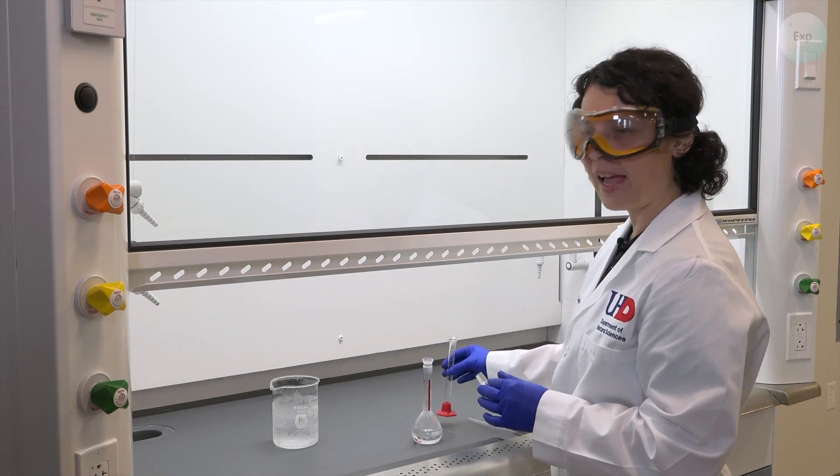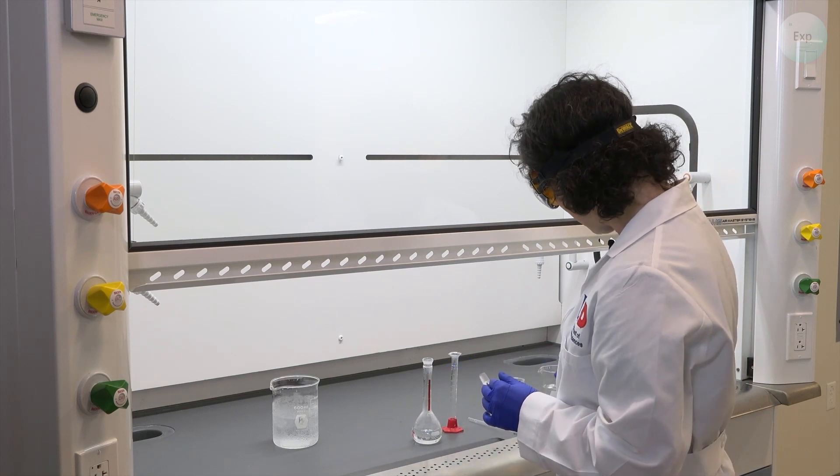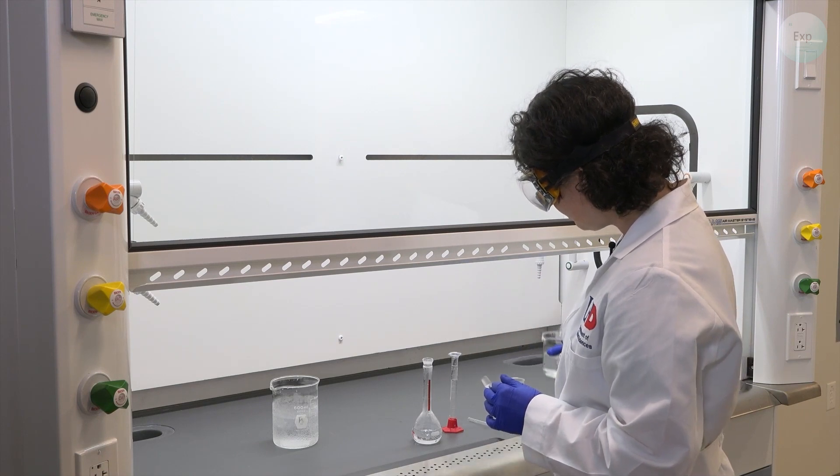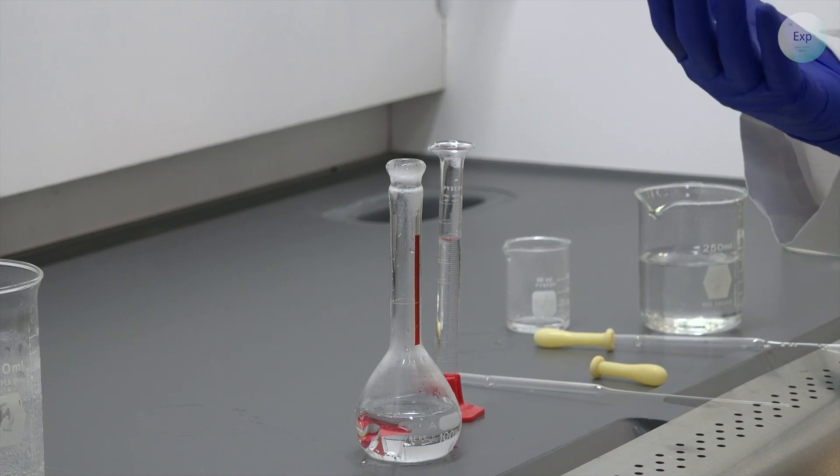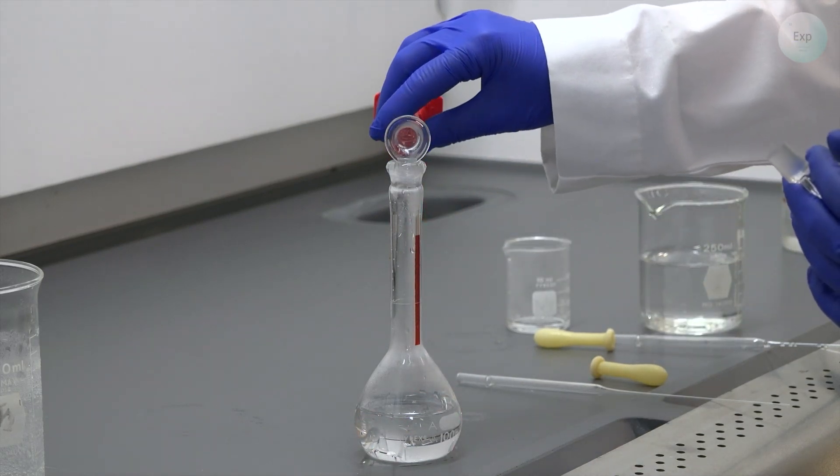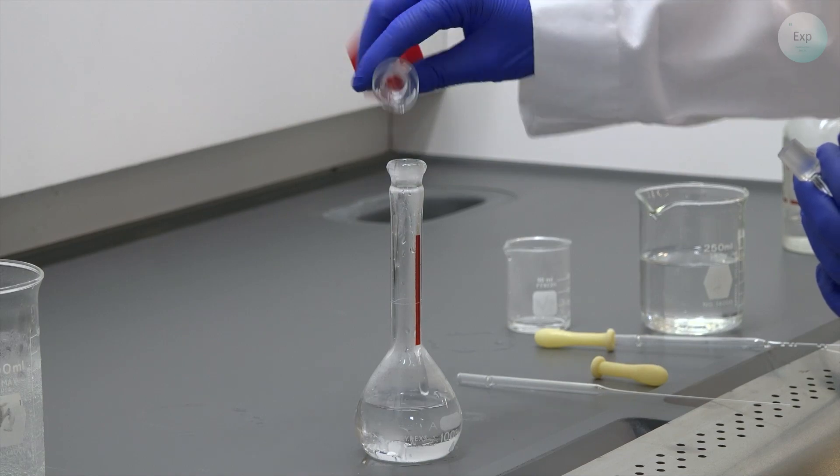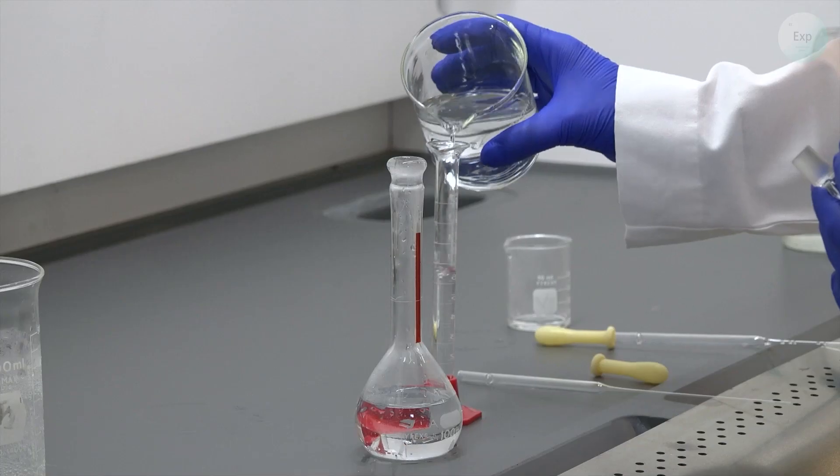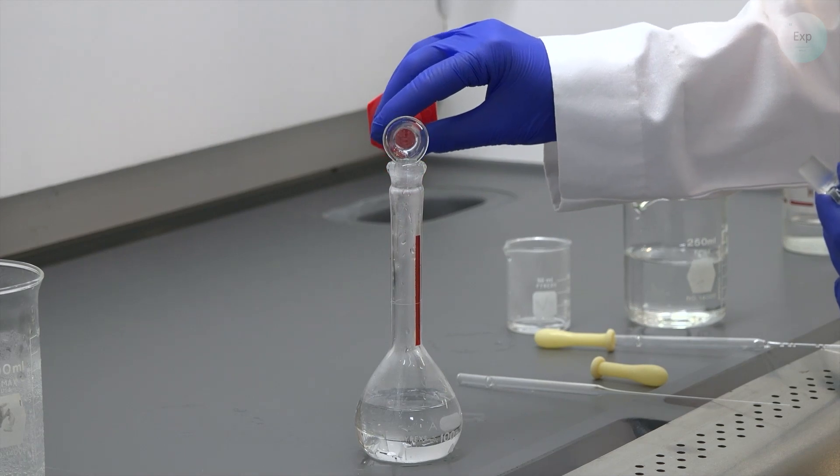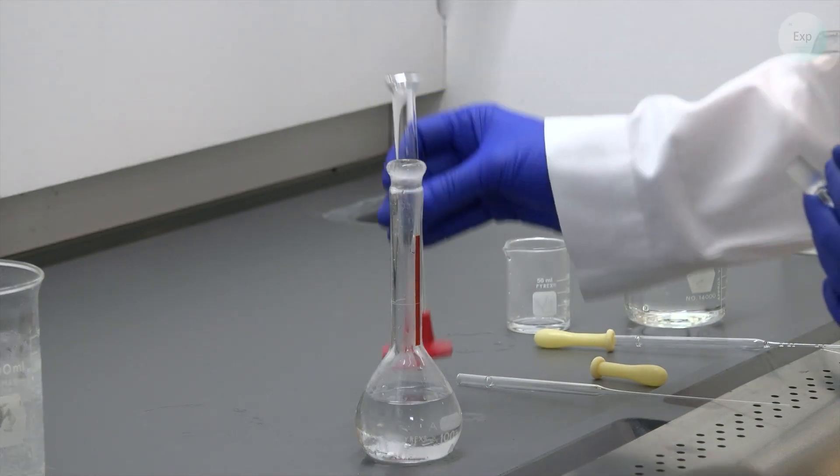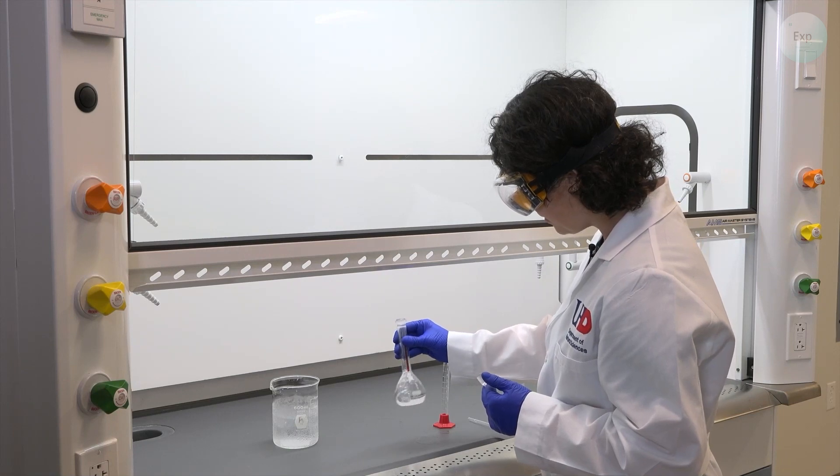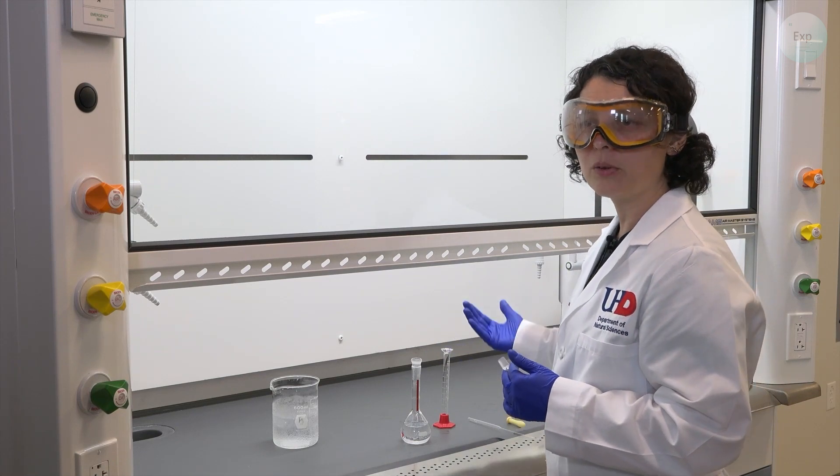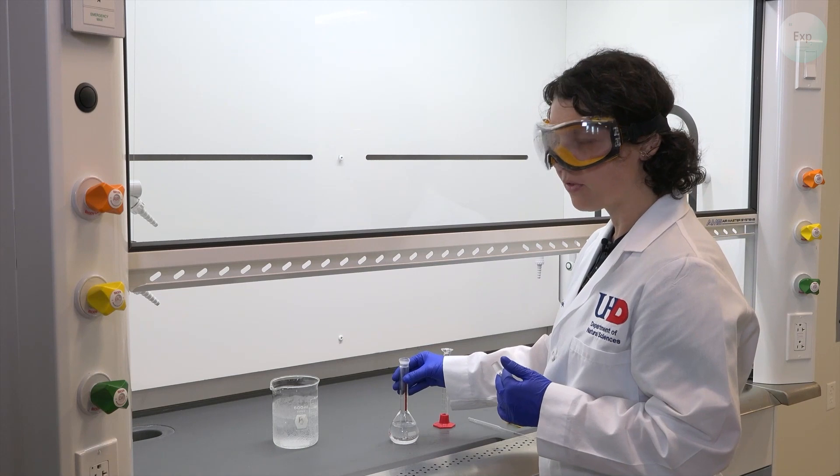Next, I want to ensure that all my hydrochloric acid has transferred. So I will add a small increment of deionized water into the graduated cylinder. It can be as small as you want it, and it can be as much as 10 milliliters. And we do this at least twice. So we have the solid acid successfully transferred into the volumetric flask.